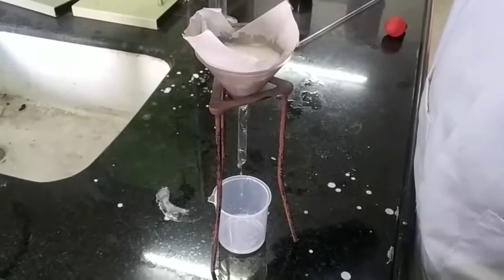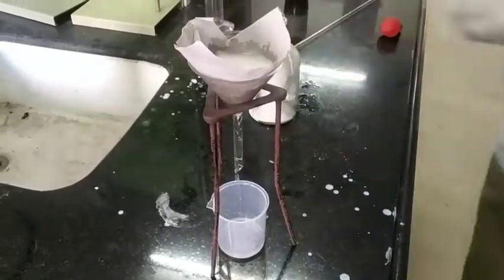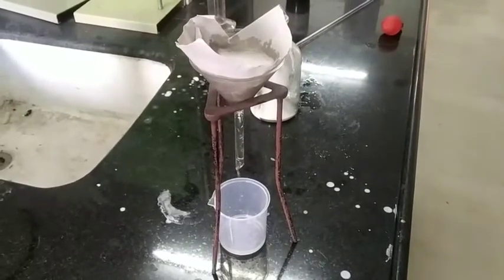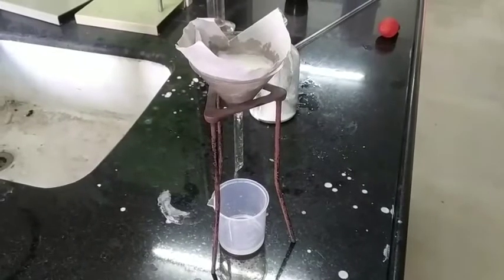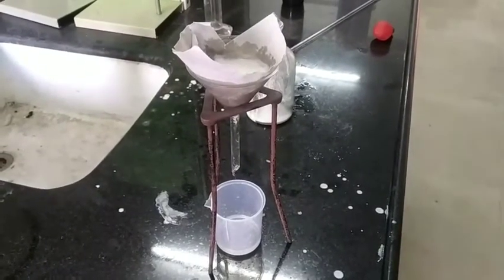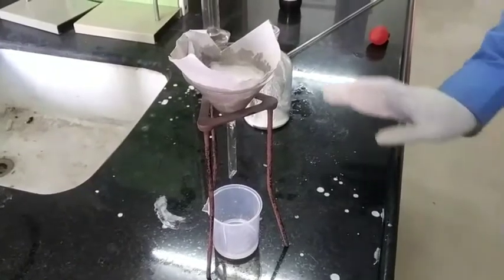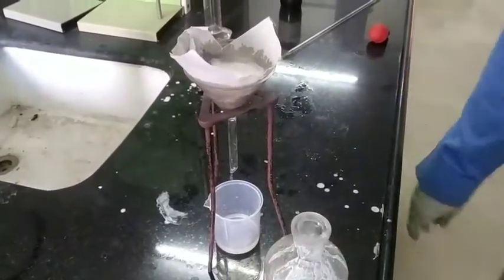Wait until all the filtration process is completed. Before filtration, we put the solution for 15 minutes to stand to settle it.